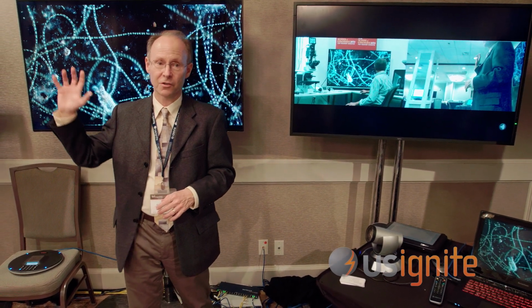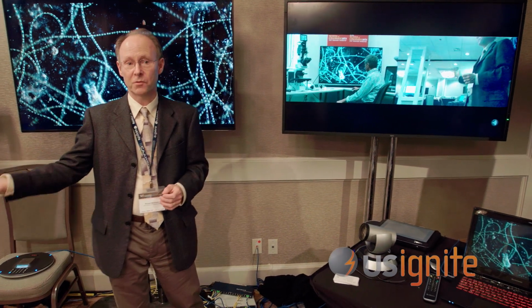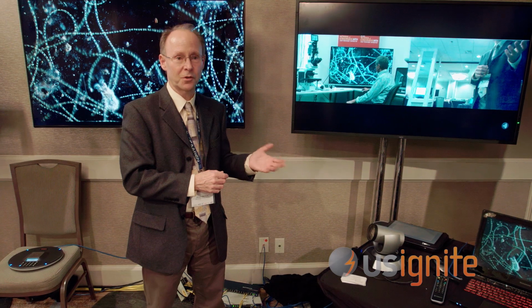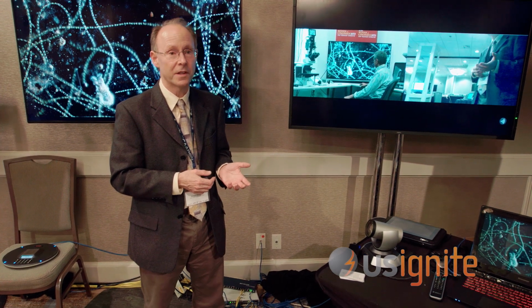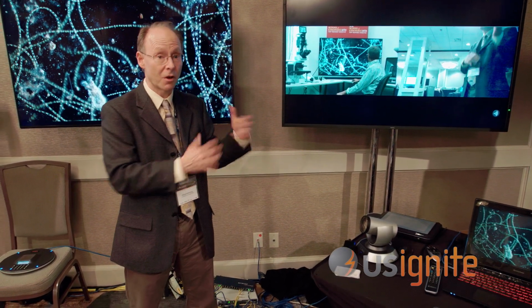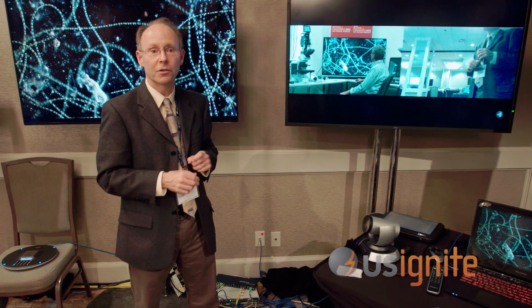In this case, they're overlooking the Tennessee River. So they're getting samples from the Tennessee River, doing various types of enrichment. They'll be sending those samples to us via overnight delivery, and marine biologists like Professor Dave Caron at USC will then be looking at the samples of the students' experiments, along with his own, and telling the students, okay, here's what's happening in the micro world.